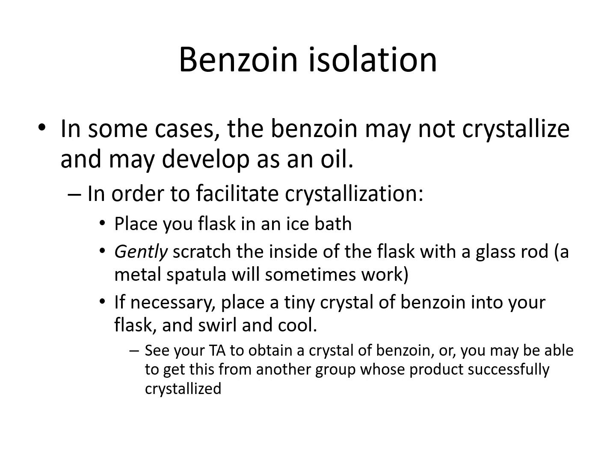If not, the third option is to use small, pure crystals that are already formed as an initiator for the growth of the crystals. We call them seed crystals because they initiate the formation of the crystals.